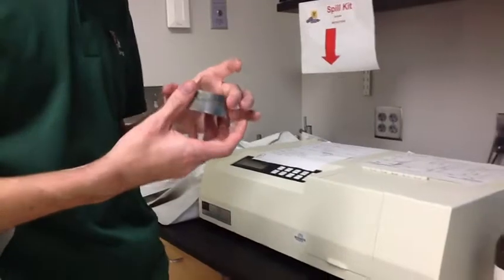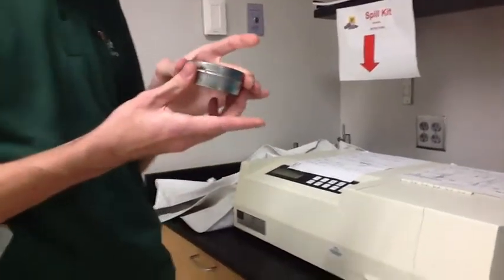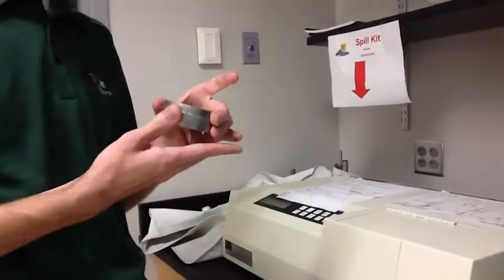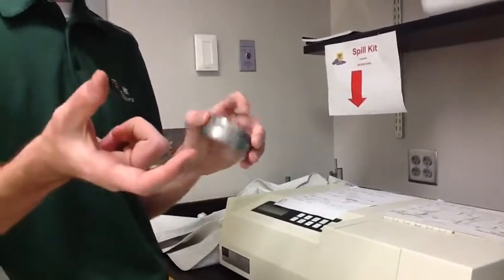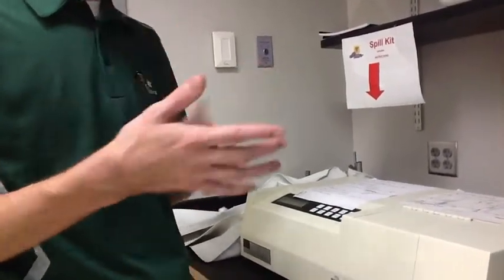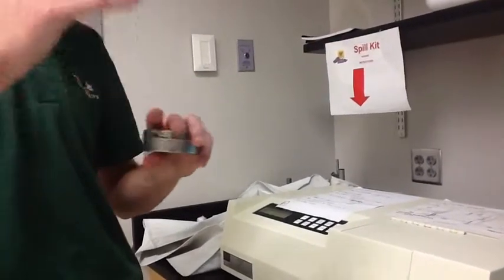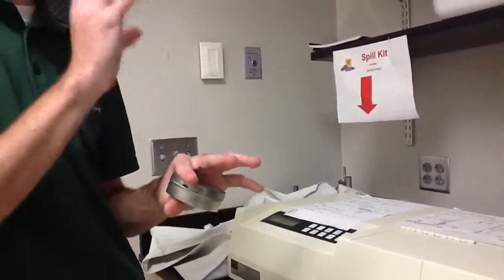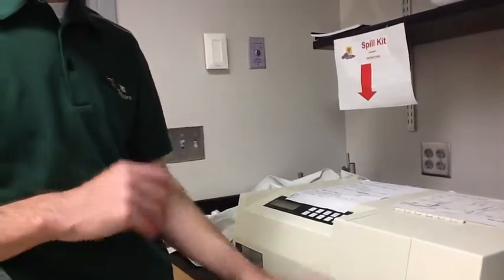What things could go wrong with the IR spectrum? If you don't have enough of a product, I might not be able to distinguish some functional groups. If you had a mixture of products, if you had some starting material left over, for example if we started with alcohols and converted them, you shouldn't have any alcohol in this IR spectrum, so you shouldn't see an OH stretch in there. If you do see it, it could interfere and make the spectrum look a little different. And then I don't know what would happen after that.